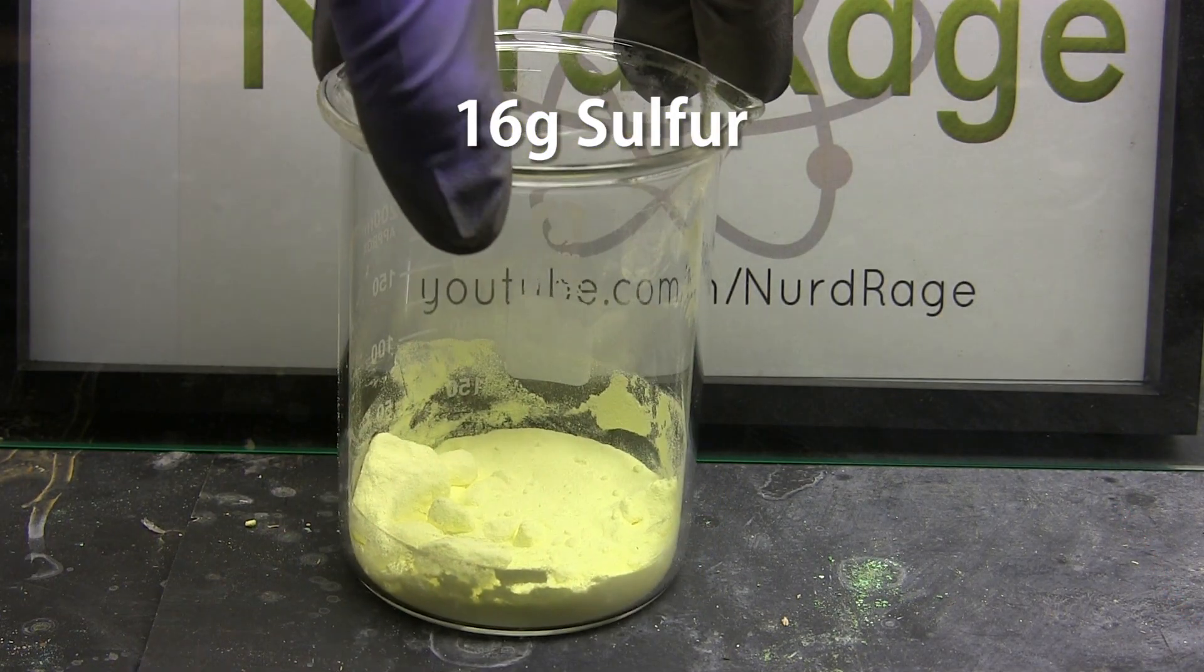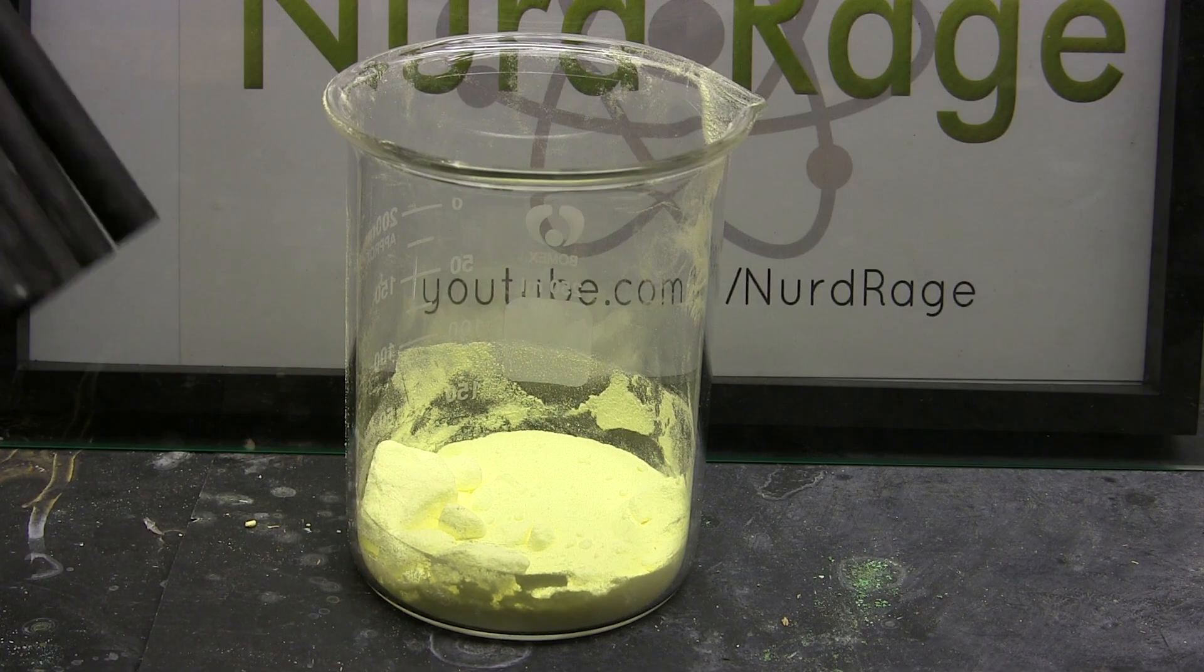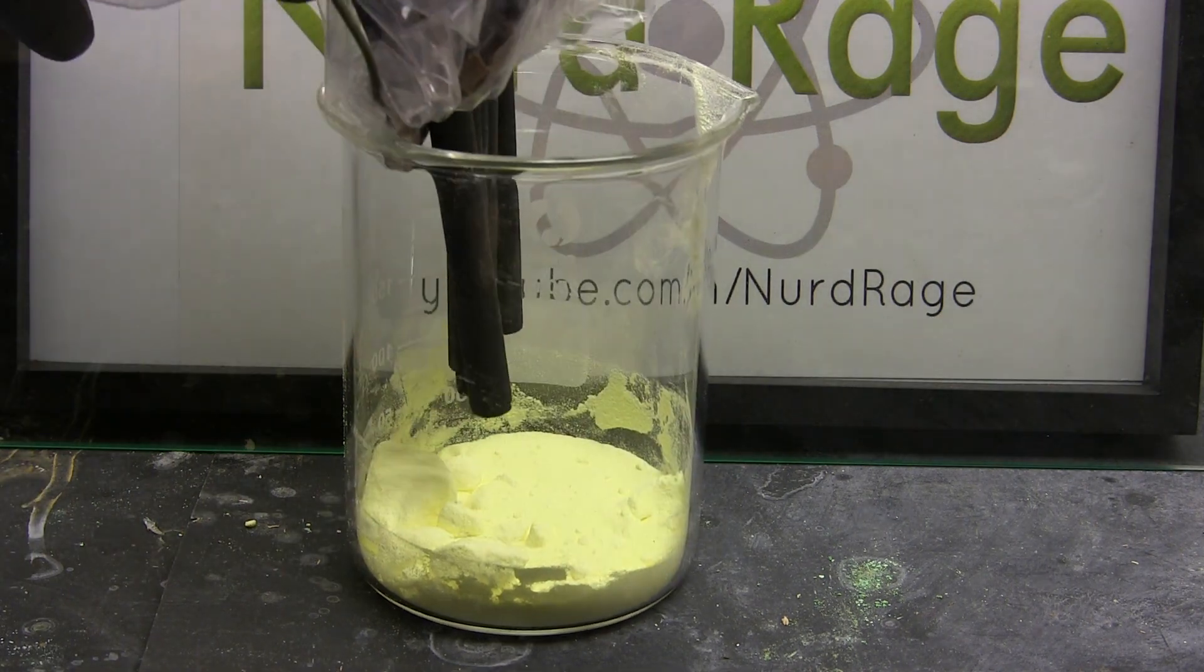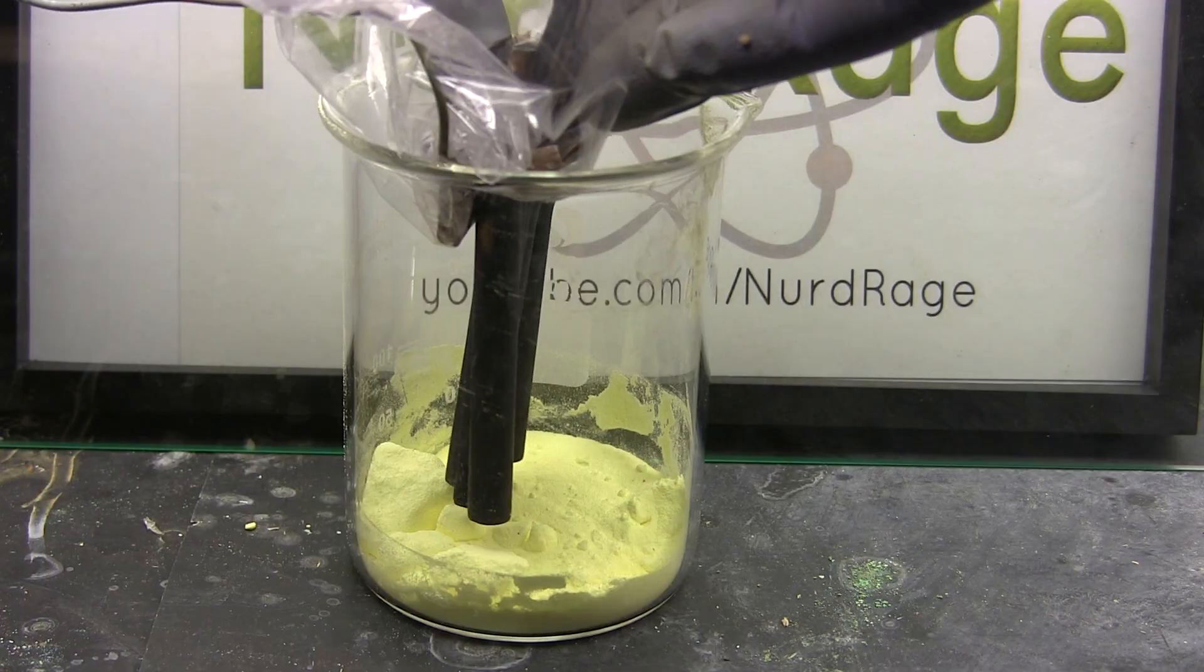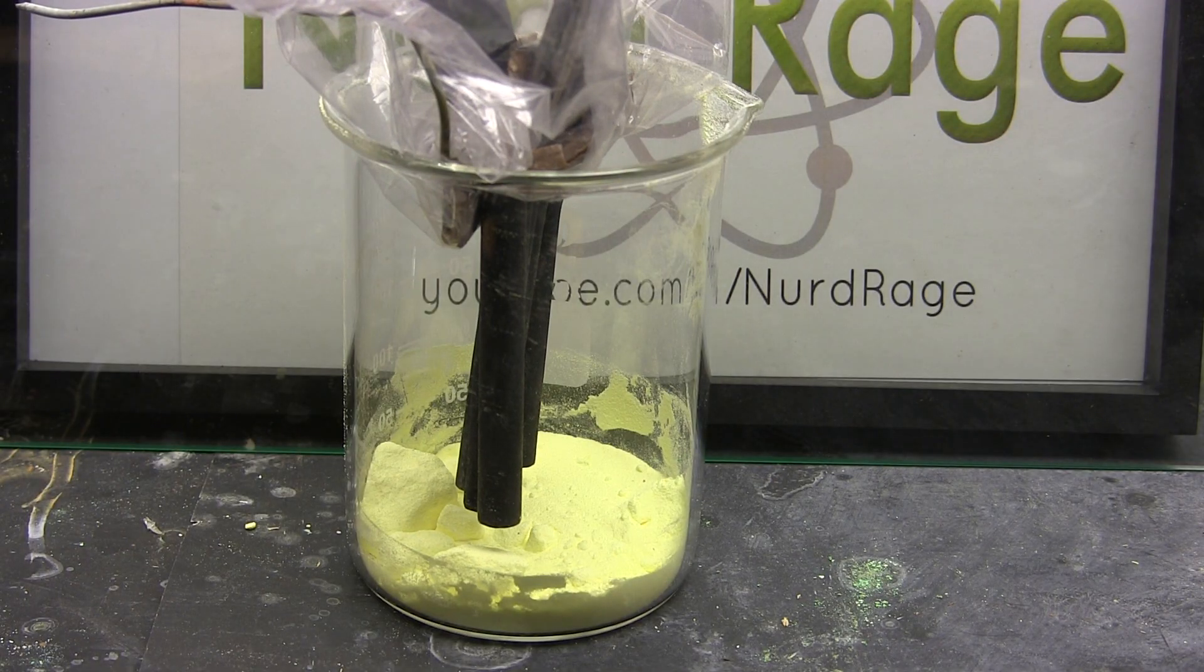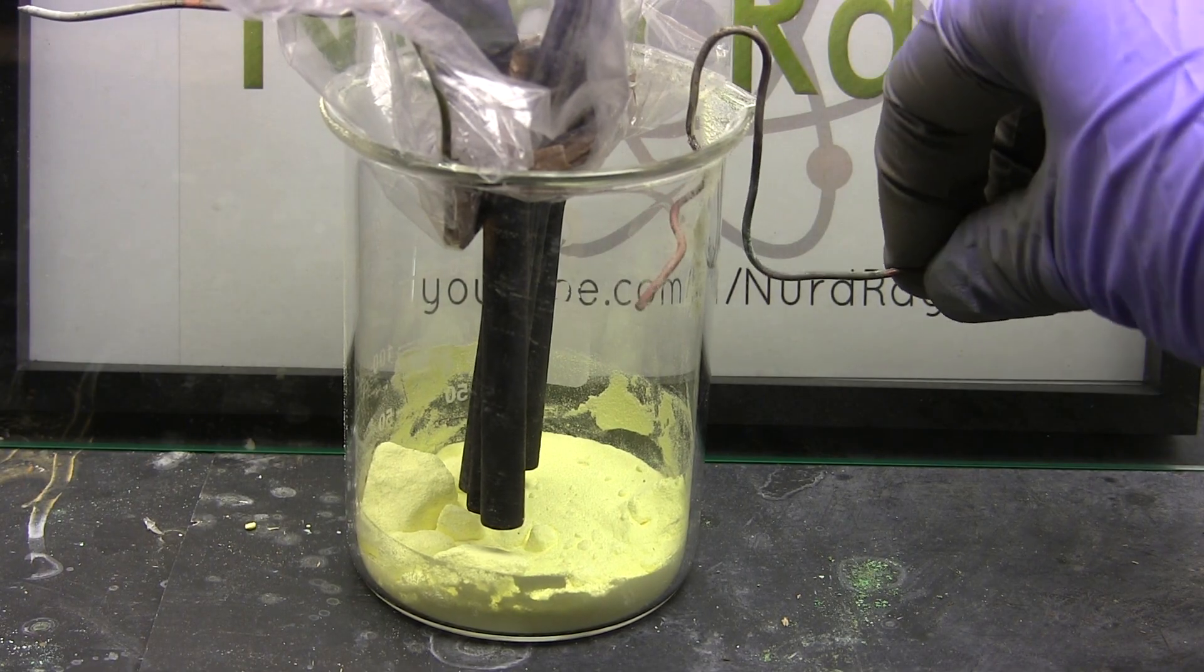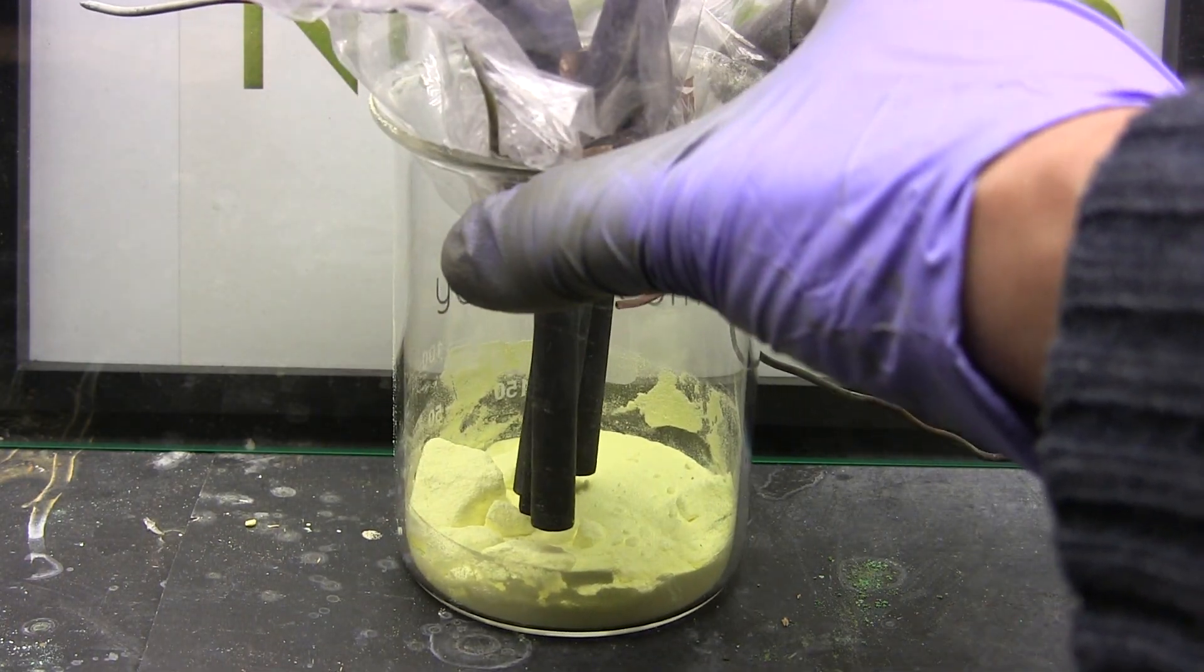First we start with about 16 grams of sulfur in a 250 milliliter beaker. Next we insert a carbon electrode we'll use for the anode. I'm using a carbon raft electrode consisting of 5 carbon rods obtained from lantern batteries. For the cathode we'll be using some copper wire. It's meant to be close to the surface as we don't want it submerged too deep. I'll explain why later.